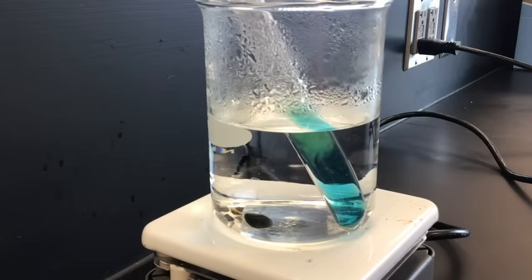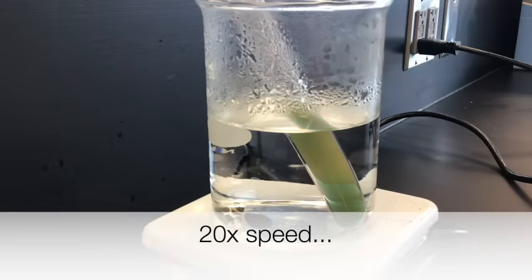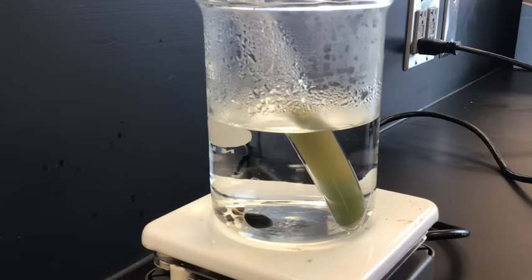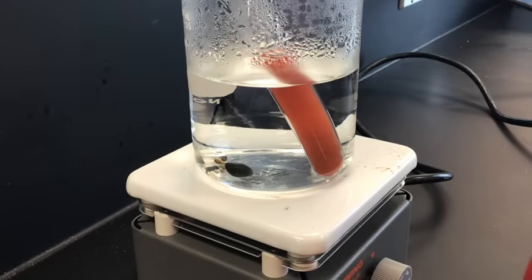It looks like it's starting to go through a color change — definitely a positive result. It looks like glucose was definitely present since the color change occurred. Here's what the color change looked like after about five minutes in the hot water. So definitely a lot of glucose had diffused out of the bag and into the pure water in the beaker.